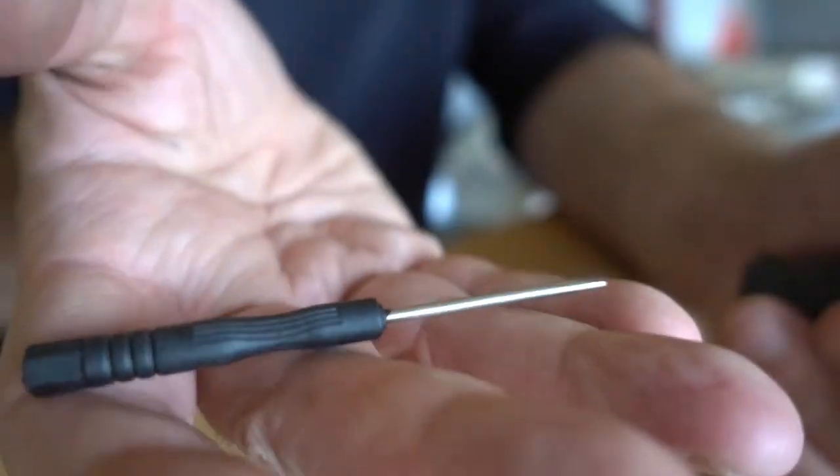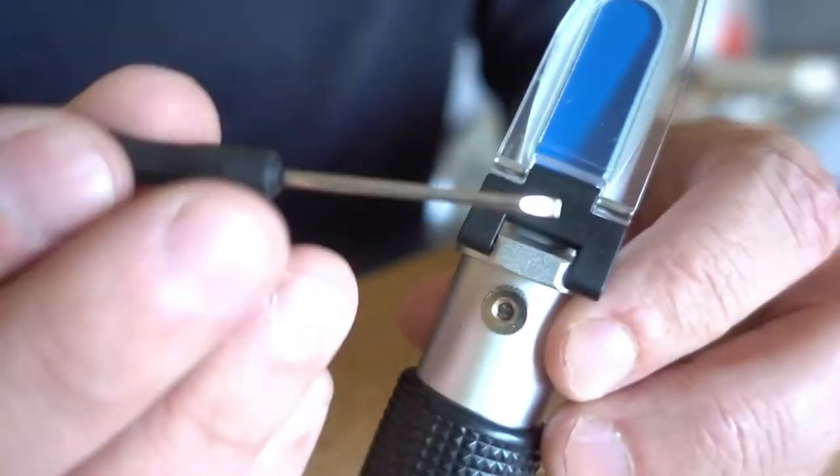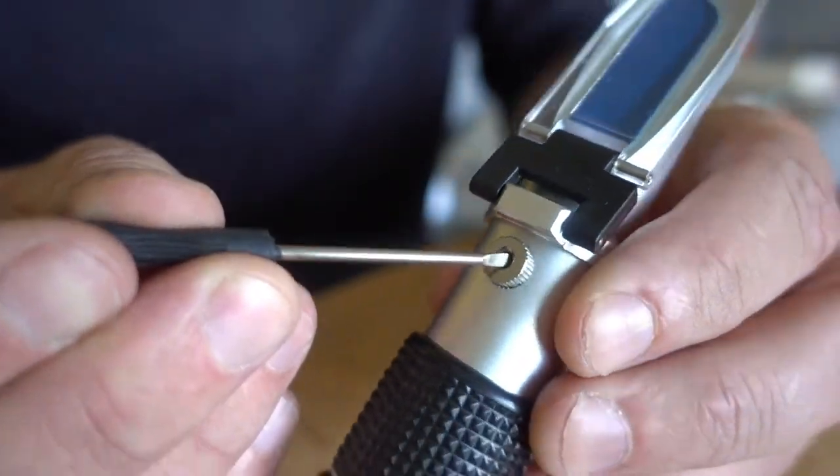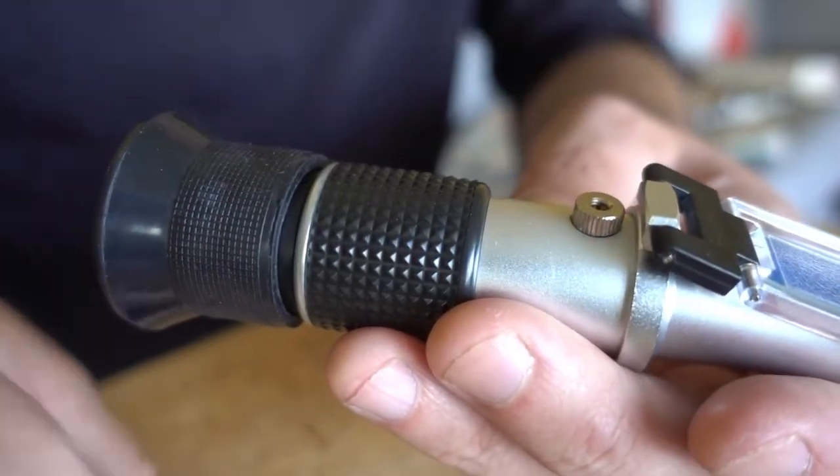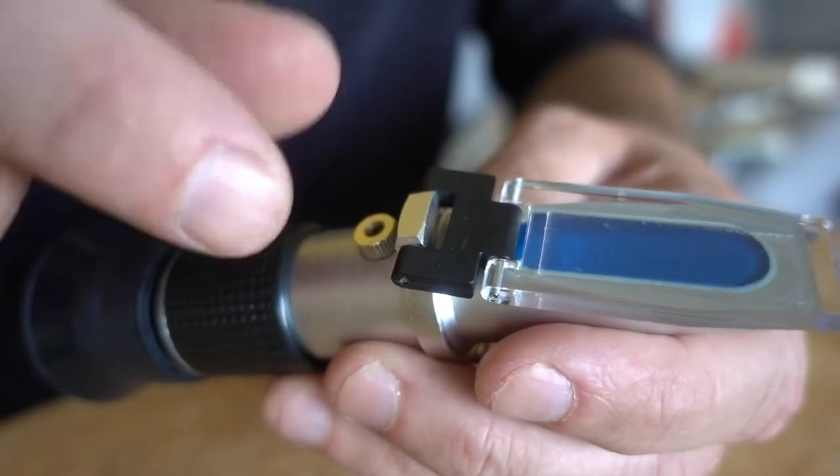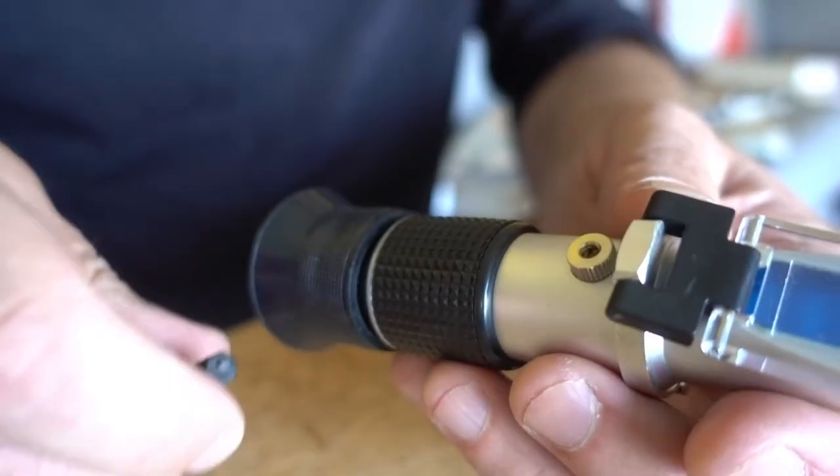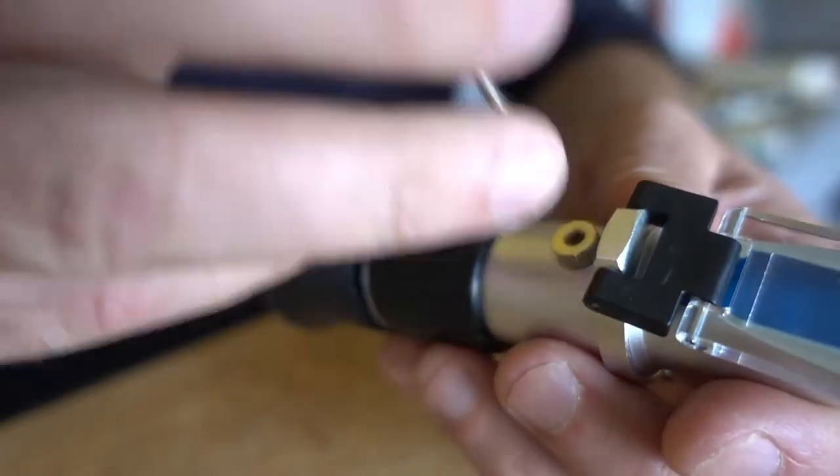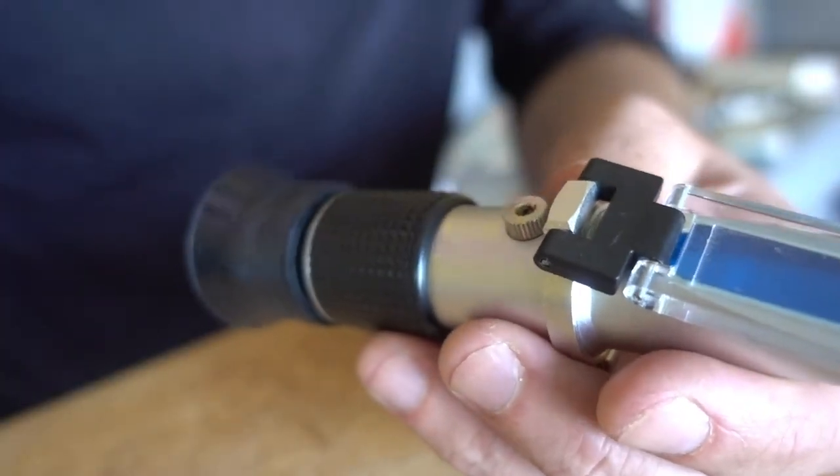Most refractometers will come with a small screwdriver like this even the cheap ones and the screwdriver goes right here into this little screw right above the top of the refractometer and this screw is used to calibrate the sensitivity of the refractometer. So if the reading is wrong or off in any way you can use this little screwdriver to just fine tune it.